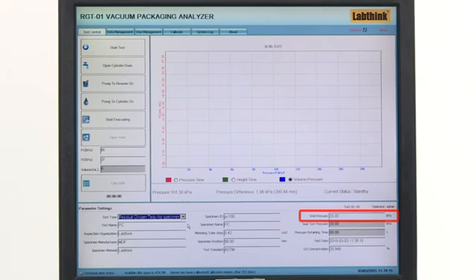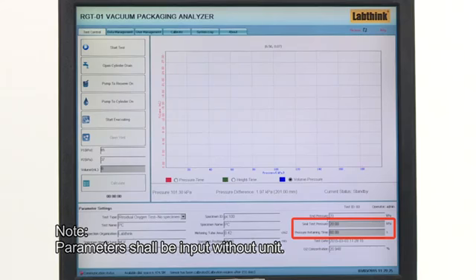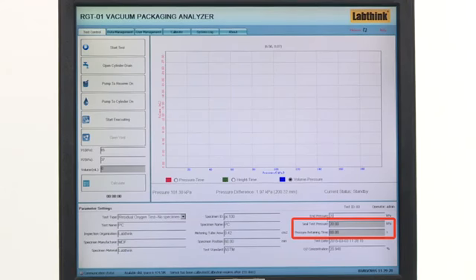End pressure. It is used to determine the end of a test. When set value is reached, the test ends. Input 20 and the recommended value ranges from 10 to 20 kPa. Seal test pressure. Pressure retaining time. It is used in seal test.